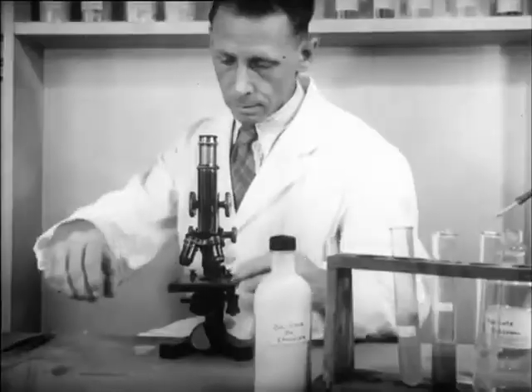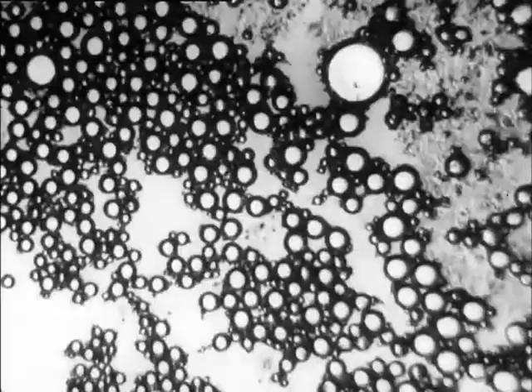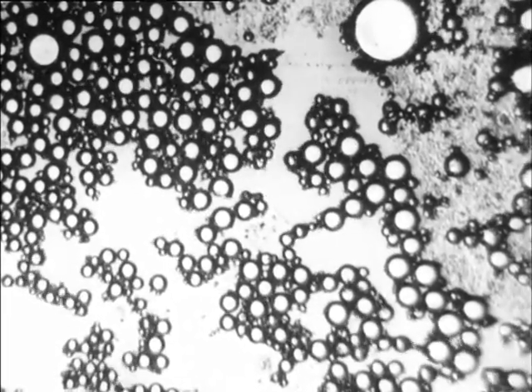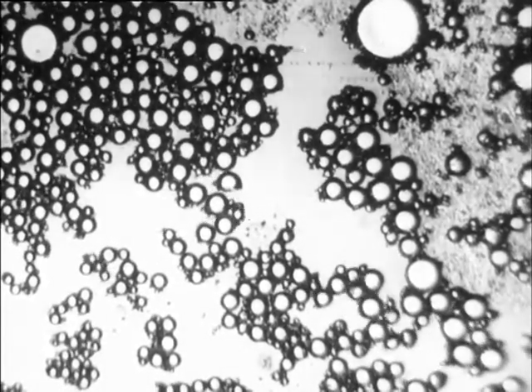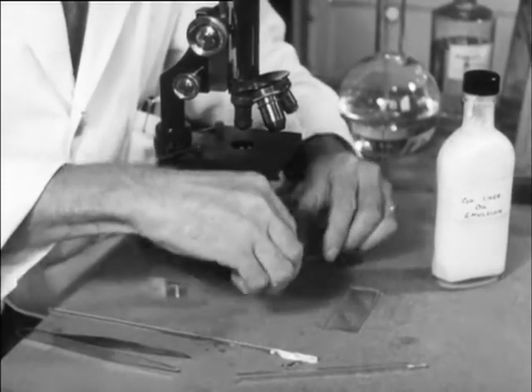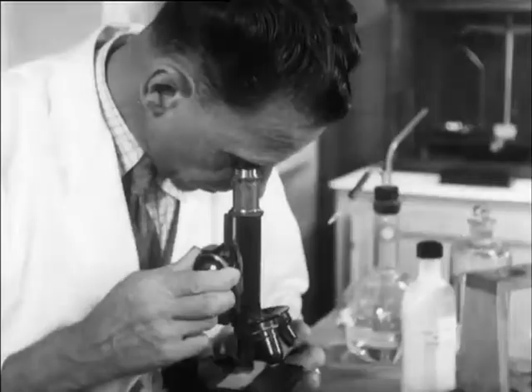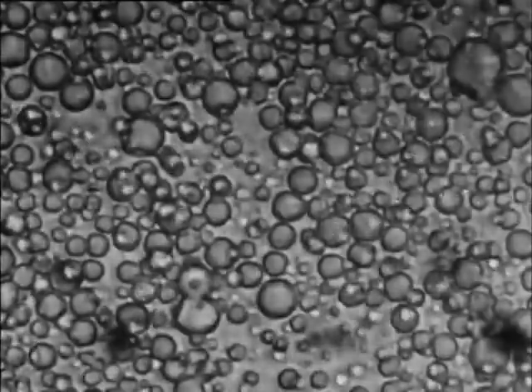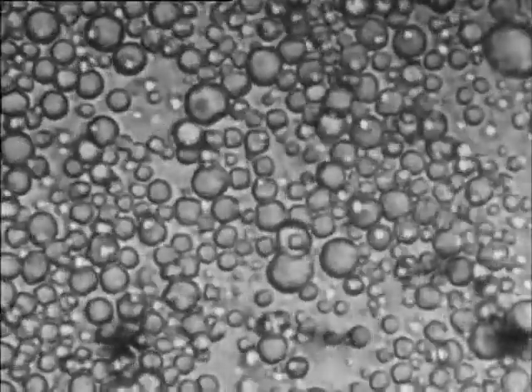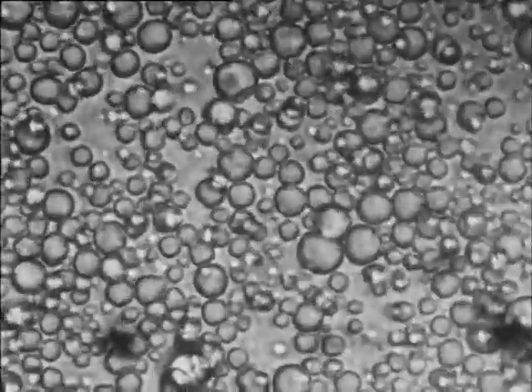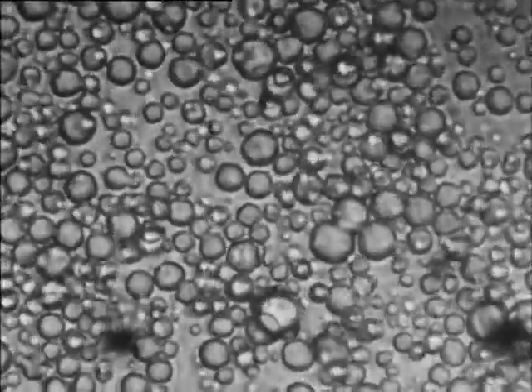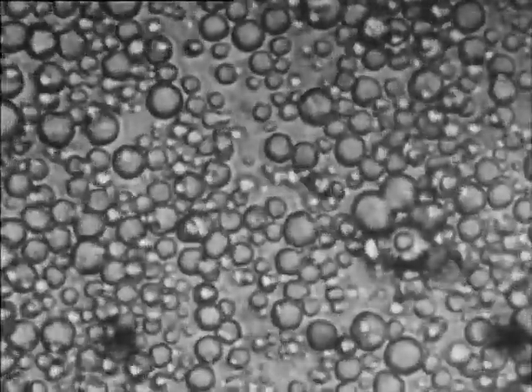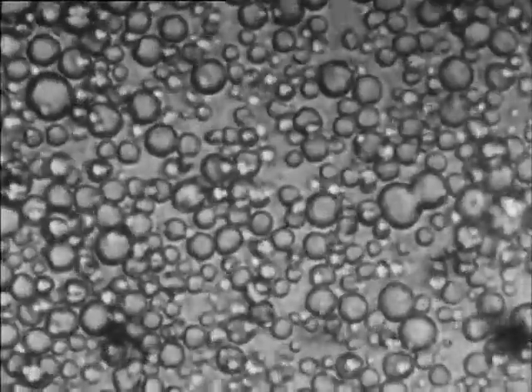An examination of the opaque paraffin oil and water emulsion shows the latter as a clear meshwork in which are suspended globules of oil. Some globules are seen to enlarge as others coalesce with them. The oil is slowly separating out. The dispersed globules must remain in suspension more or less permanently if the system is to be considered an emulsion. One important factor that prevents the separation is the size of the dispersed globules. In a good emulsion, the globules have a diameter of one hundred thousandth of a centimeter. Here on the screen you have a magnification of approximately one quarter million times. This is a cod liver oil emulsion.